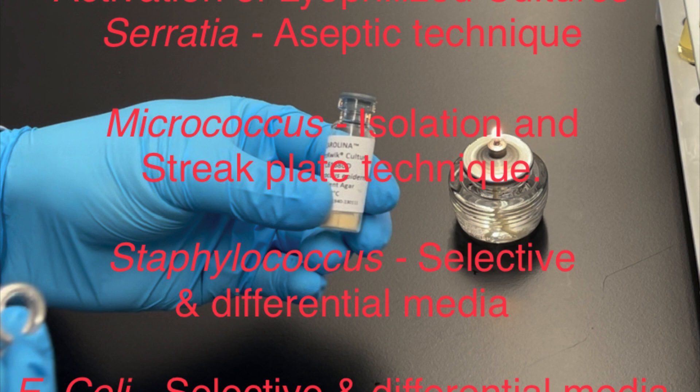you'll have to reactivate serratia. So that's the bacteria that you should reactivate. Another bacteria called micrococcus you will reactivate when you are starting the isolation and streak plate procedure. That's the second lab we'll do.